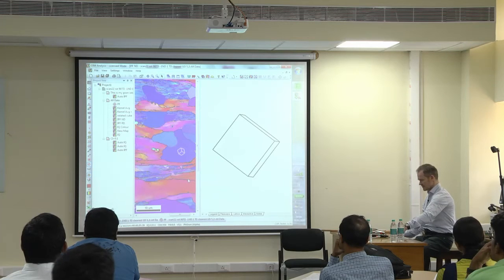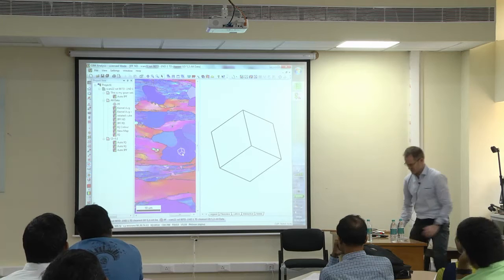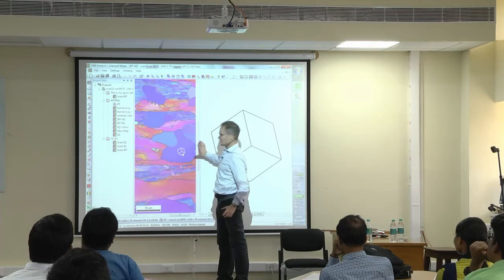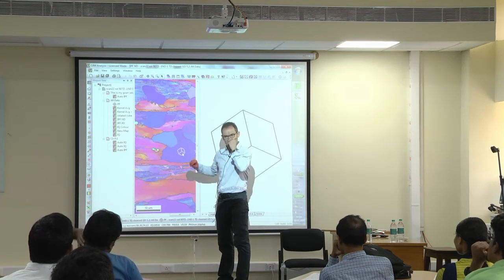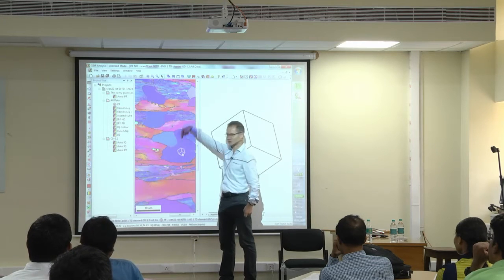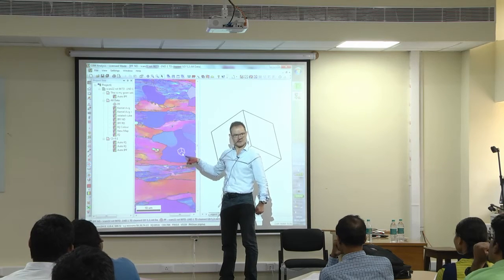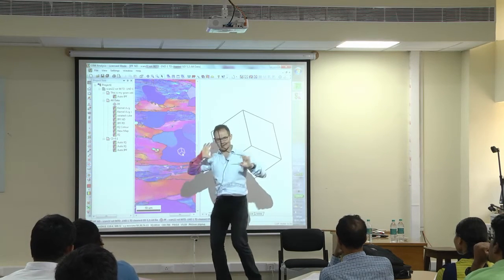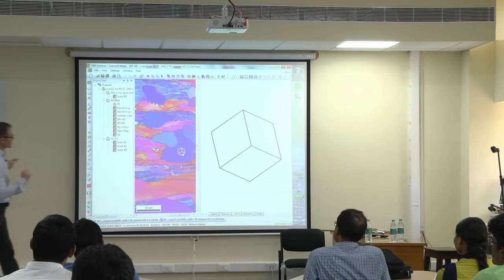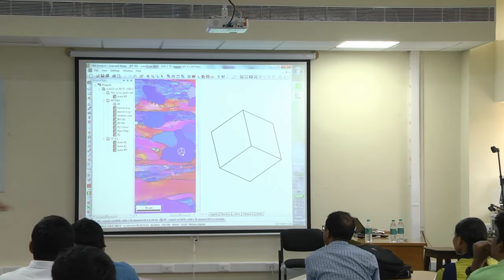Yes, okay, good. So now I have plotted a little crystal inside, and you would now look, once again, you could now say, okay, this crystal stands like that in the sample. No, it's not right, because the data are all rotated. The crystal stands like that in the sample if I would look from top here. But I look from here, so in principle, this is not the right plot. Okay, I hope that is approximately clear. There is some trouble with that, but for our texture analysis, it's better to rotate such that we are in a standard orientation. And you will see why.